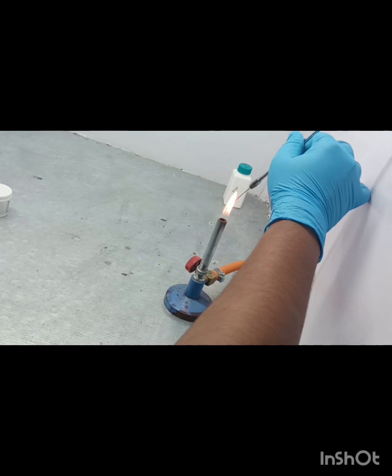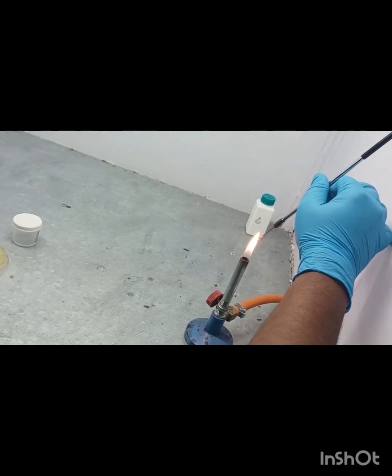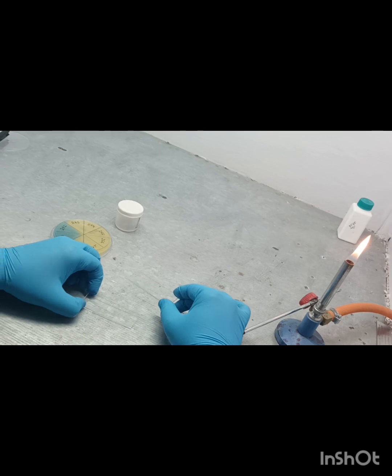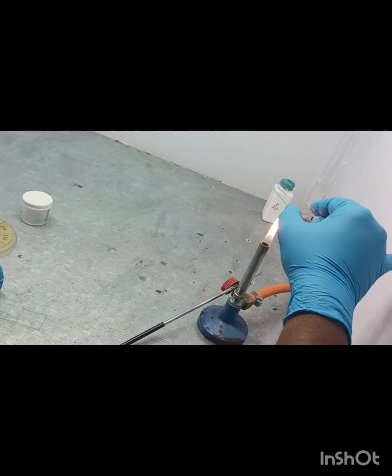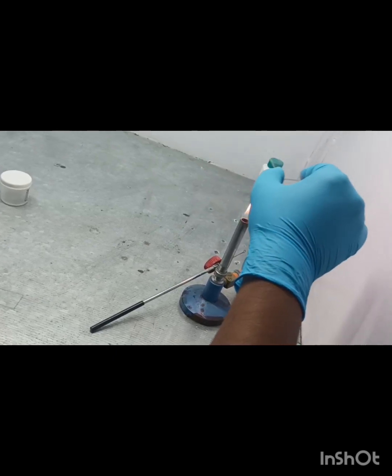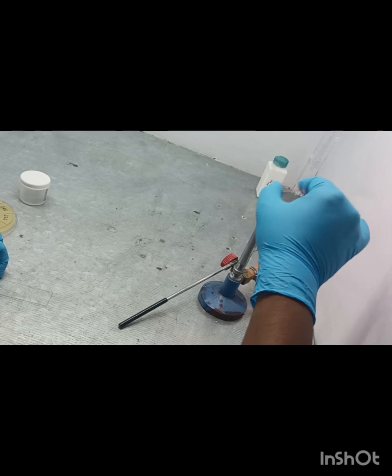After preparation of the slide, we have to again sterilize the nichrome loop, and allow the smear to dry with air, or we can gently heat fix like this. So these two procedures: at first air dry the smear, after that heat fix.